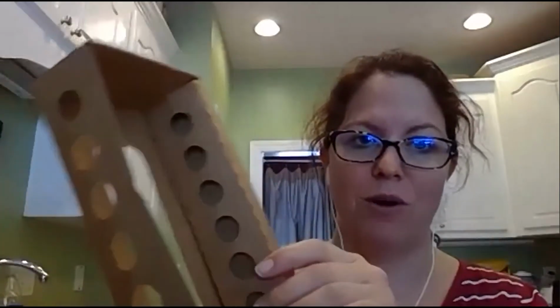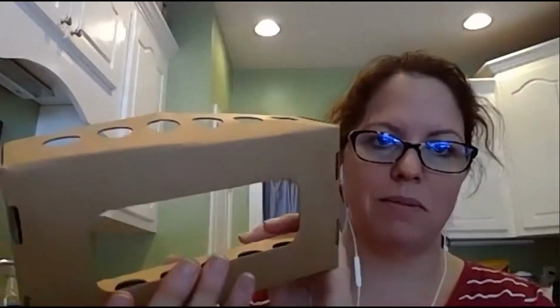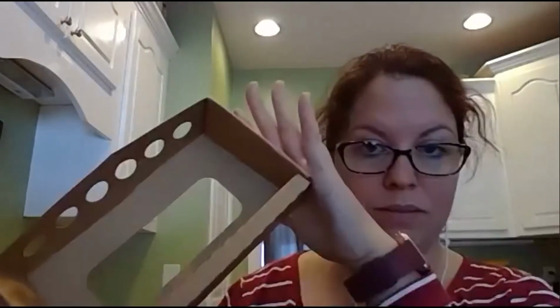You've got 4 test tubes. I did want to show you what your test tube rack looks like once you get it put together. There's a lot of folding going on here. So this is what your test tube rack ends up looking like. If you fold all those perforated areas and kind of pop things in, you end up with this. So you have 4 different solutions, and I have a list.